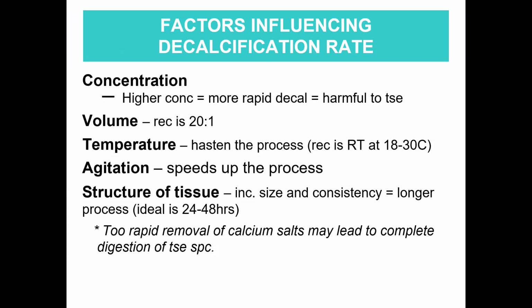This is a form of process that involves ionization because basically you remove ions, your calciums. So recommended temperature again is 18 to 30 degrees Celsius. Ideal time required for decalcification is 24 to 48 hours. And the ideal volume of your decalcification agent is 20 times, so 1 is to 20 ang ratio.